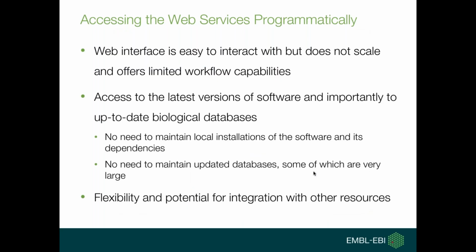So now the deal is I would like to try to convince you why you should use our web services programmatically. The web interface is easy to interact with, but of course it doesn't scale. If you want to analyze hundreds or thousands of sequences, going over the web interface is probably not the best you can do.